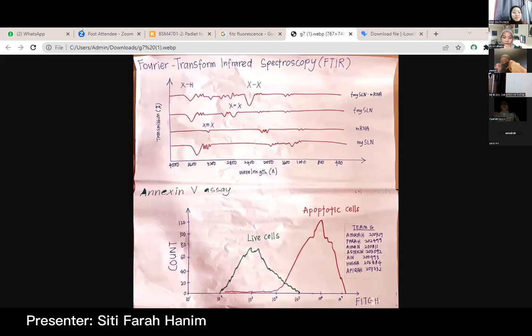To test for the cytotoxicity of the COVID-19 vaccines, since the cells are said to undergo apoptosis, we assume the best assay to use is Annexin V5. Annexin V5 works by being conjugated with FITC, where it binds to the phosphatidylserines. These phosphatidylserines are only exposed on the outer membrane during the early apoptosis stage. During early apoptosis, the FITC will conjugate to phosphatidylserines, or PS in short, so we can observe the green fluorophore in their plasma membranes.